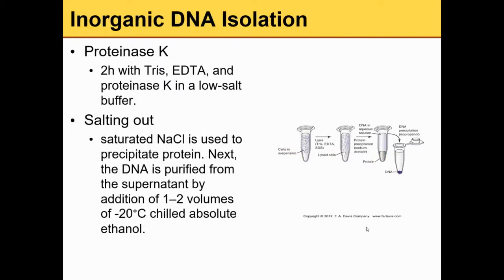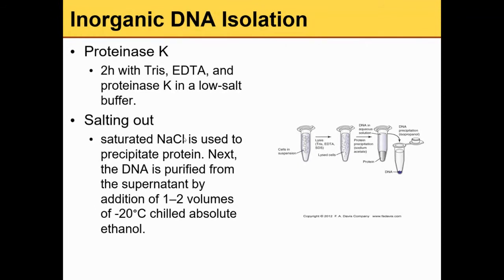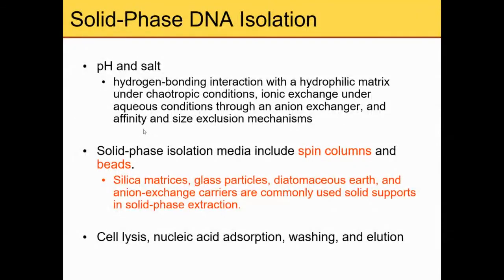And then proteinase K, so in inorganic DNA isolation, basically it's a salting out, so you add sodium chloride, and then at cold temperature in the presence of ethanol, then you'll be able to precipitate the DNA. So that's inorganic DNA isolation.